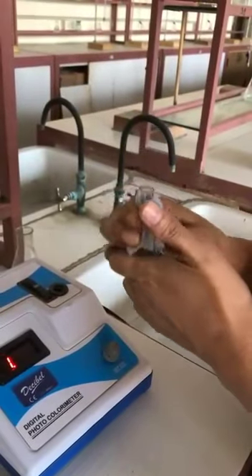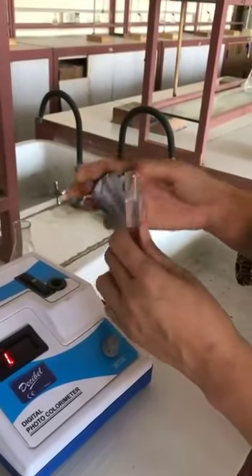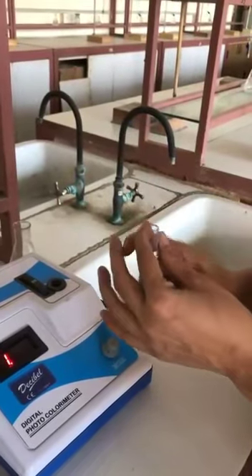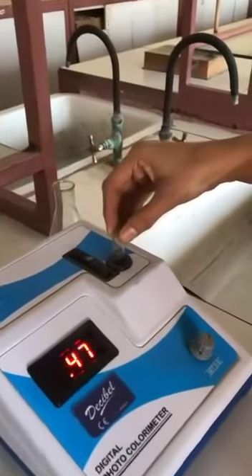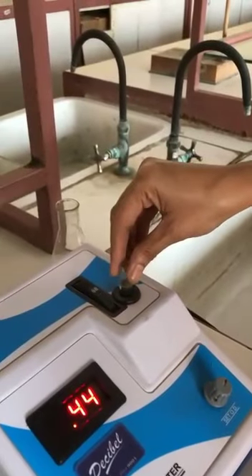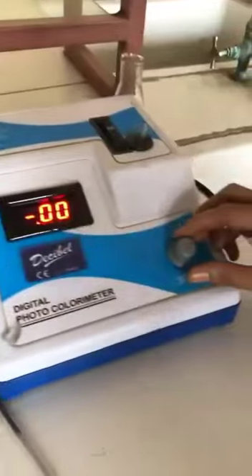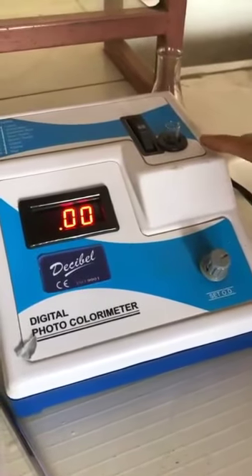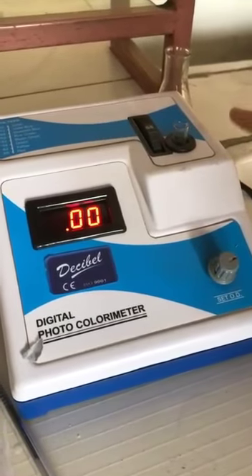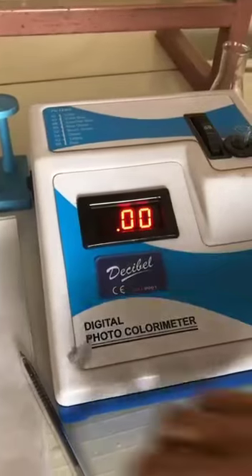Otherwise, the moisture will damage the instrument and your reading will also vary. Now, insert this cuvette in the colorimeter. Now, we have to calibrate because there is no color, so it means the absorbance should be 0. Now, the instrument is calibrated.